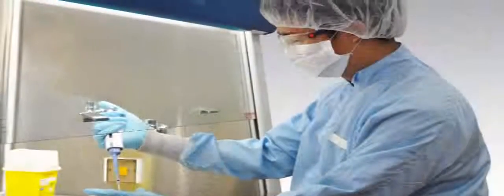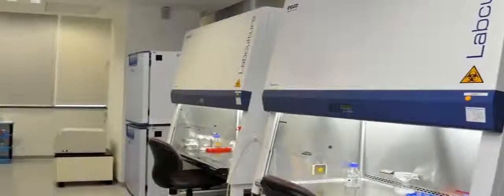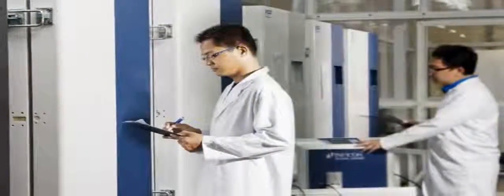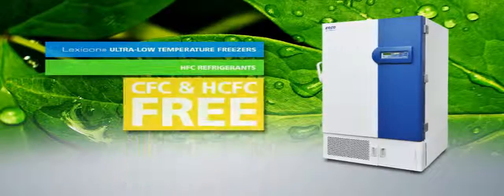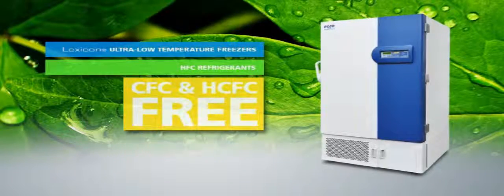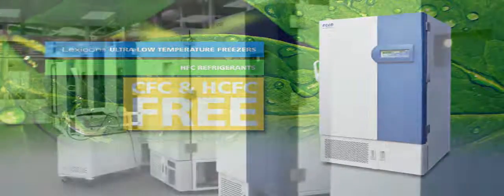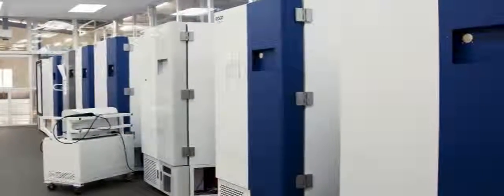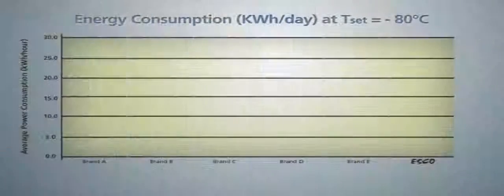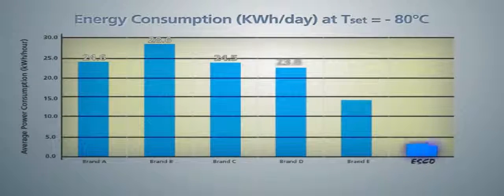Esco is dedicated to providing environmentally friendly efficient green products and therefore ensures that only CFC free agents are used. Only environmentally friendly CFC free and HCFC free HFC refrigerants are used. Biodegradable high performance synthetic polyester oil is used. Comparatively low energy consumption and low heat emission.